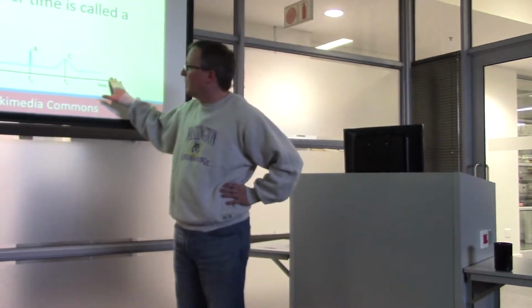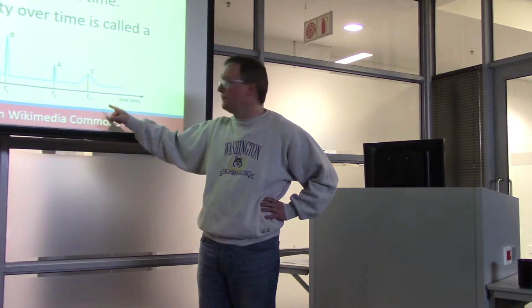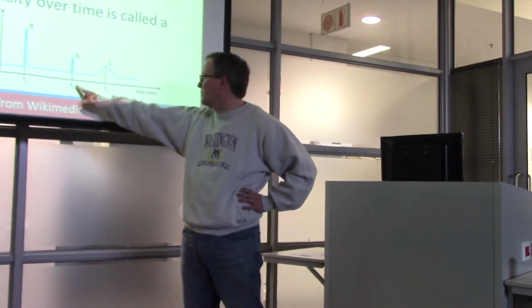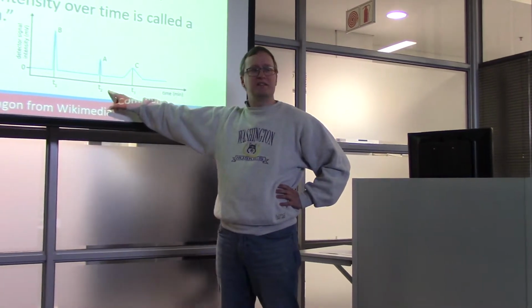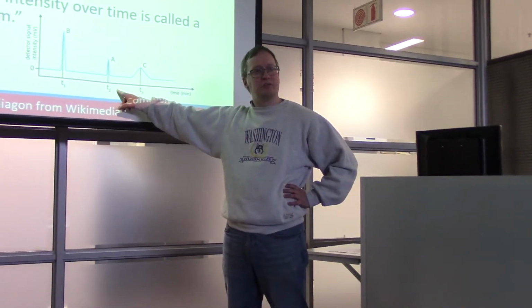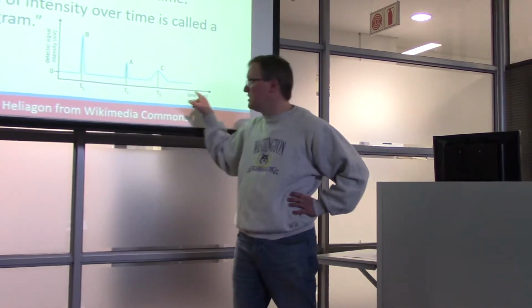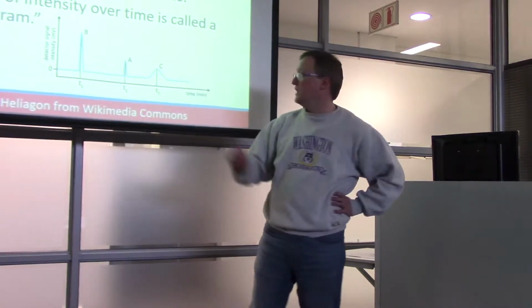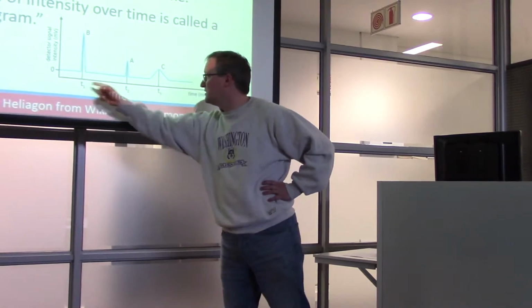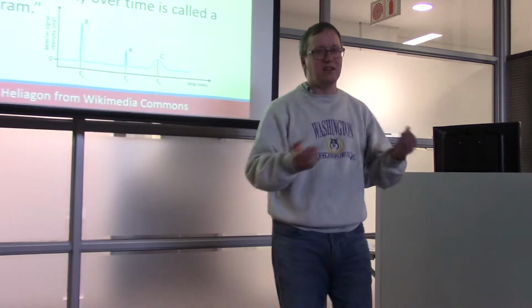It could be that if you're trying to track a particular peptide, you know it should show up around, say, 30 minutes, maybe around this time too here. But that's not to say that's the only time you're going to observe that m over z value, because there are other peptides with different retention times that also have the same m over z value. And so they could appear at different retention times and still produce a peak of intensity there.